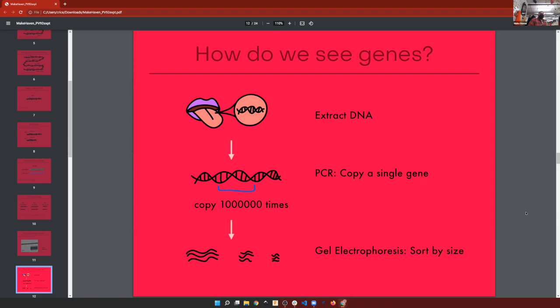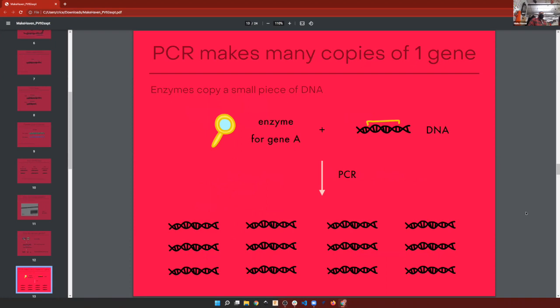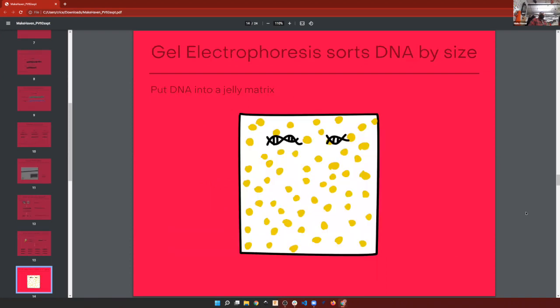That way, we can actually see without a microscope whether you have PV92 or not, or what size your PV92 is. Basically, we'll have this enzyme, the polymerase. It's like a little magnifying glass, searching for whatever we tell it, which I told it in our little tubes to look for PV92. And then it's going to go and make a ton of copies.